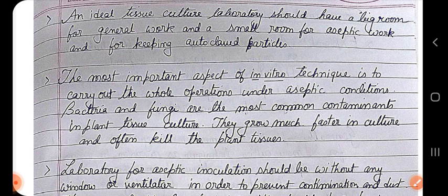And that's why when we are inoculating that explant, that plant tissue, into the culture medium, we thoroughly wash them. We do surface sterilization with the help of antibiotics, with mild detergents like Tween 20, for a few minutes. We even use a dangerous chemical as well, dilute solution of mercuric chloride, just before inoculating.